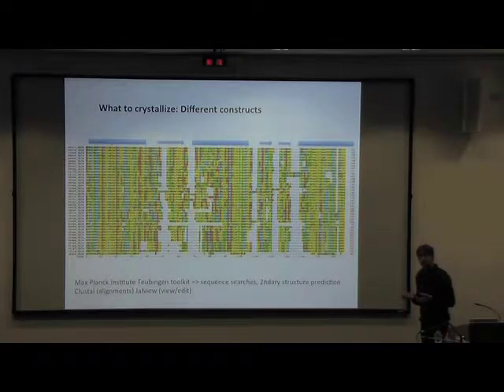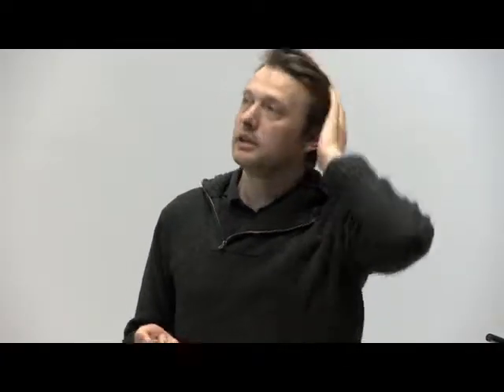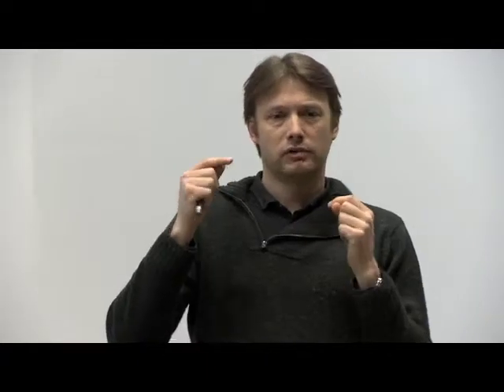You can do secondary structure predictions, which are extremely powerful, not only at this point, but also during the building of your structure. If you have a totally novel structure, having these secondary structure predictions can be very helpful when you're trying to build a piece of helix. And maybe the helix, especially at a lower resolution, say around 3 or 2.8 angstroms, may not have all the features that let you say that's an arginine, a lysine, or whatever residue.